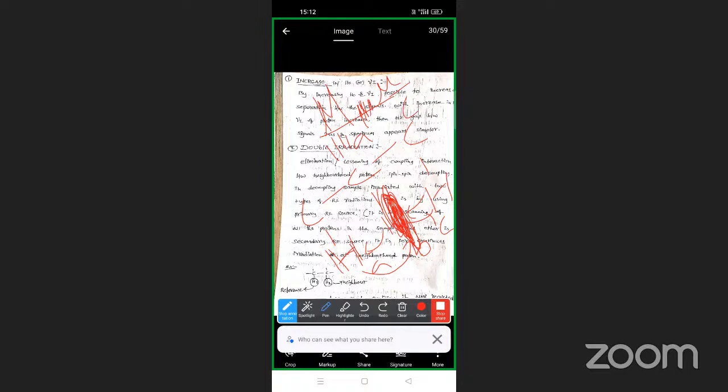You won't observe a signal for the HB proton. Then you can see there is a separation between the HA and HC protons. So that is double irradiation, where the spin-spin coupling, the neighboring proton interaction, is removed.